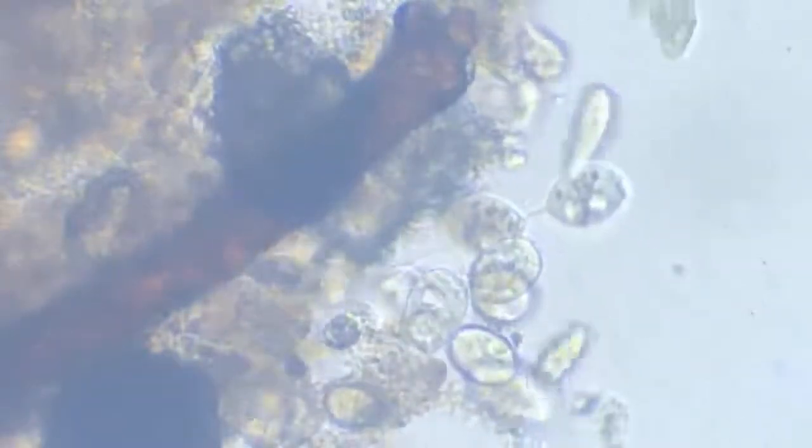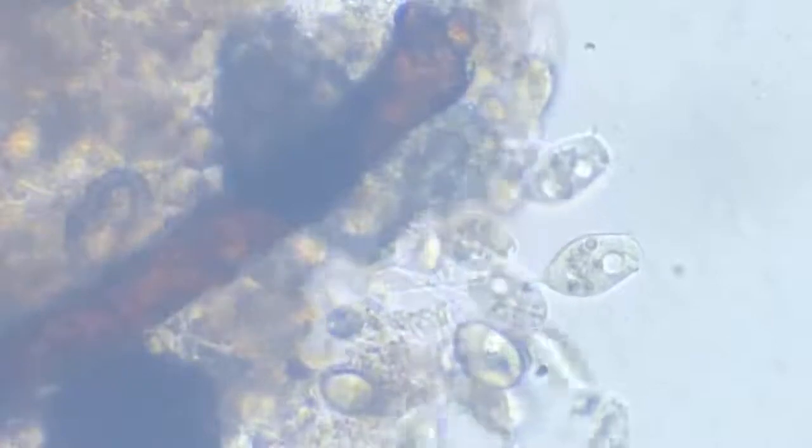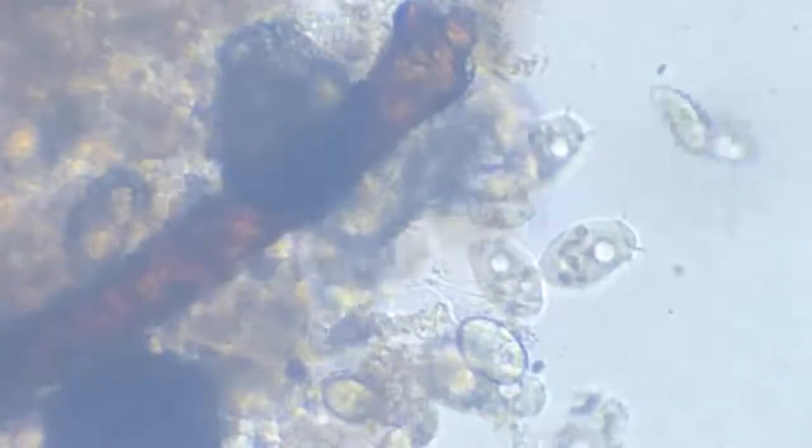This is one of the fastest of motions in the animal kingdom. Now imagine this being done by a single-celled organism. This has to be something. I'm waiting for one of those water vacuoles to be evicted. It's osmoregulating.